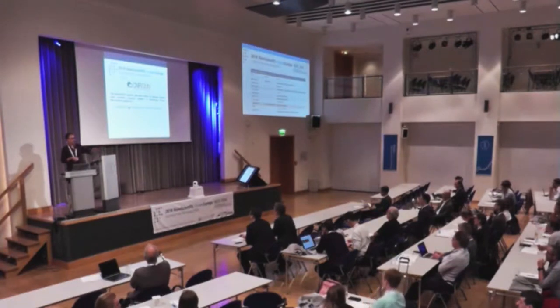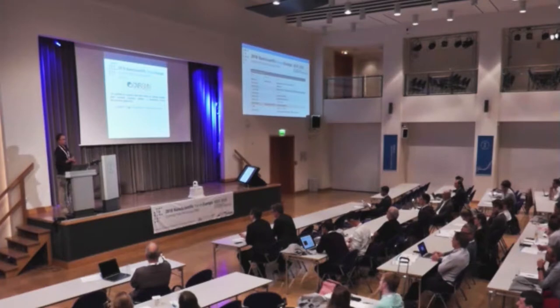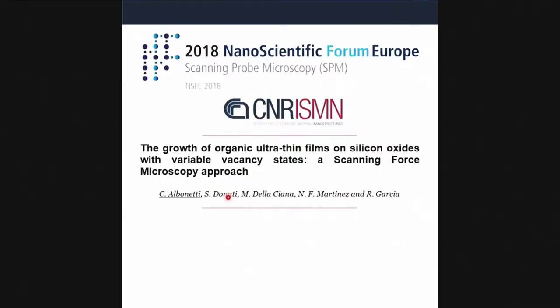Today I don't speak about a particular technique of scanning probe microscopy, but about scanning probe microscopy applied to the growth of materials. So it is more devoted to the growth of the material, the characterization of the material itself, more than scanning probe. Anyway, I want to move. Okay, the pointer is there.